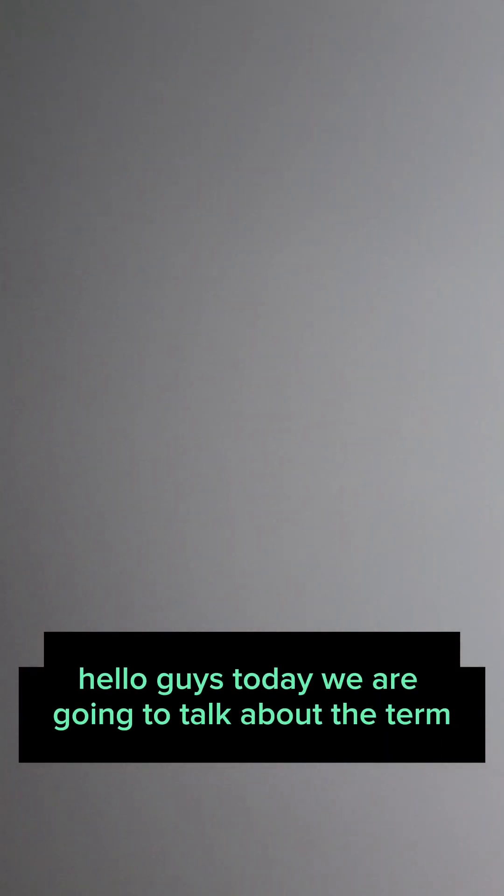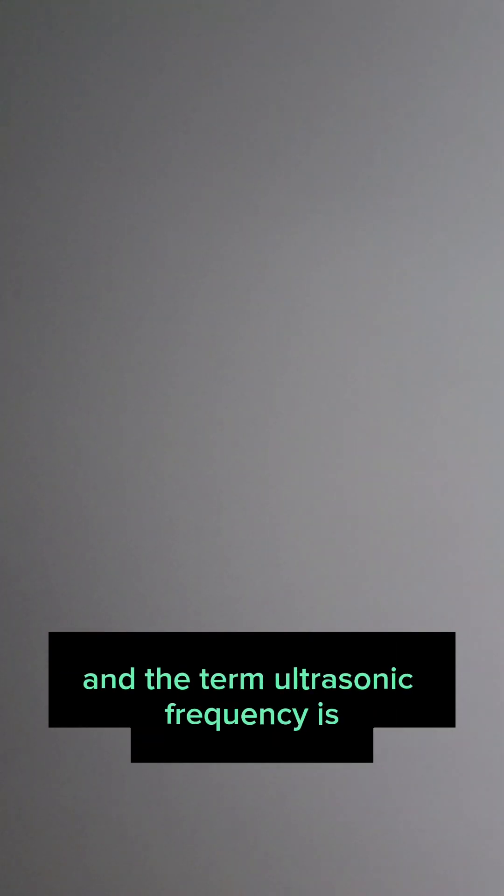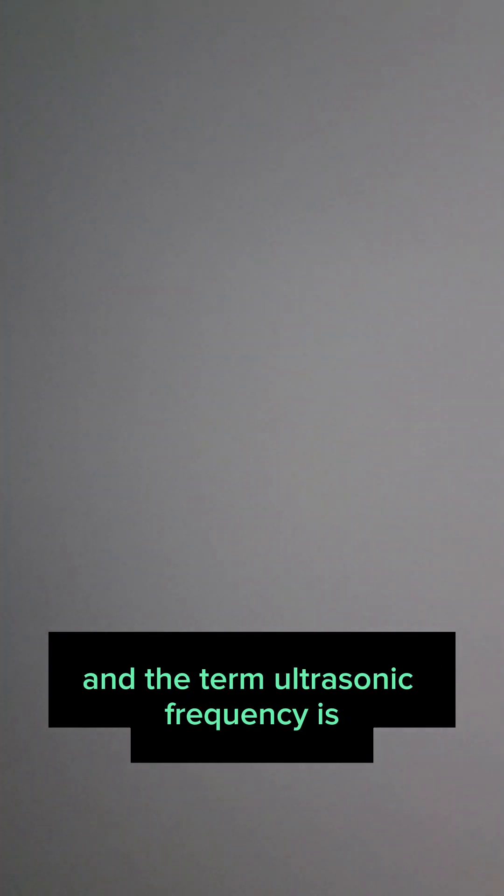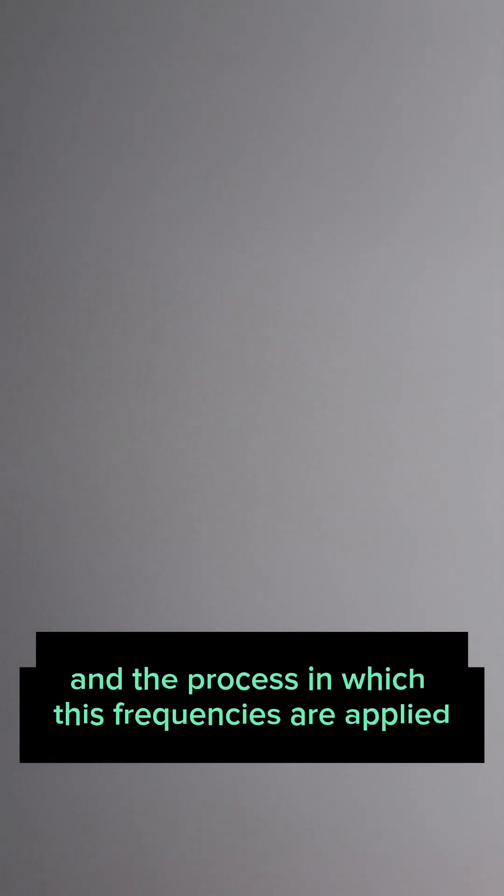Hello guys, today we are going to talk about the term sonicator or sonication, ultrasonication, ultrasonicator. So we have the word sonication. Sonication is a process. It refers to the process of applying sound energy to agitate particles or some kind of non-continuous fibers in a liquid. The term ultrasonic frequencies refers to frequencies that are greater than 20 kilohertz. And the process in which these frequencies are applied is called ultrasonication.